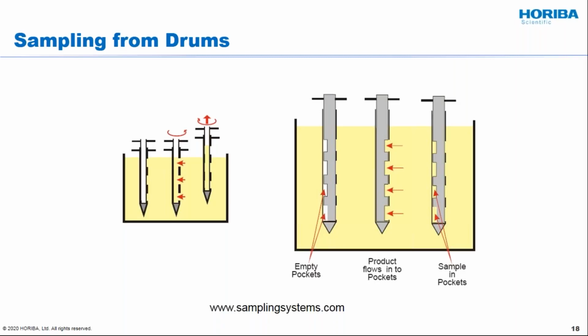And I think you can see even the techniques here are very related to the best technique, which is pulling small samples over long periods of time. You can see these drum thieves are being put into the particles. And what you're going to do is go to different areas of the drum, different heights in the drum, let's say.